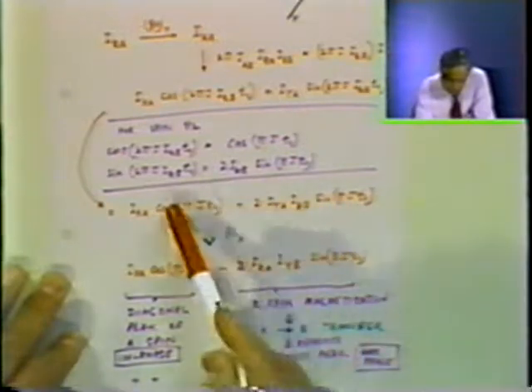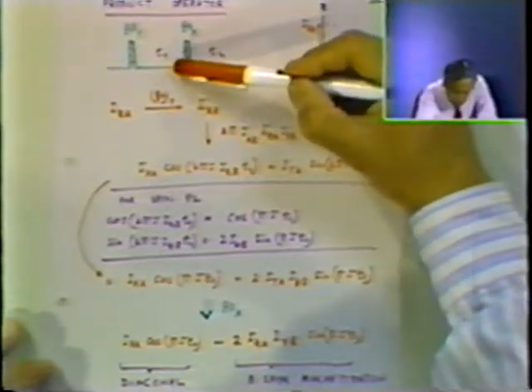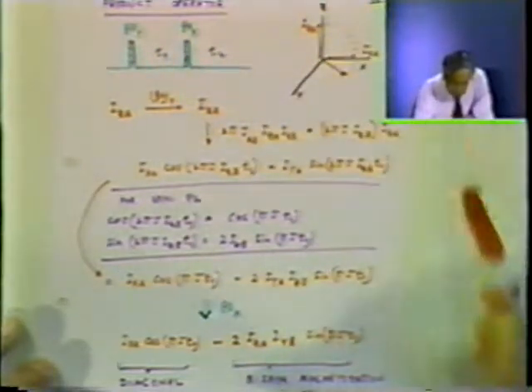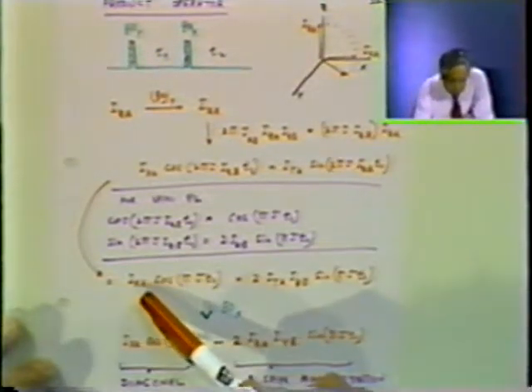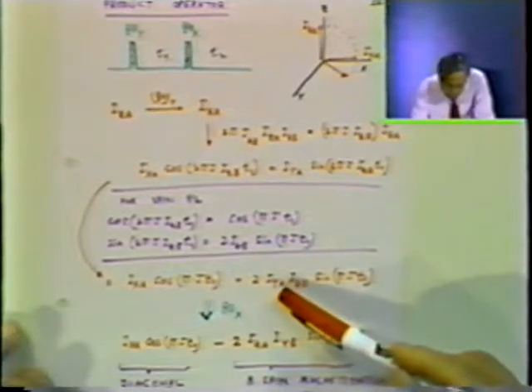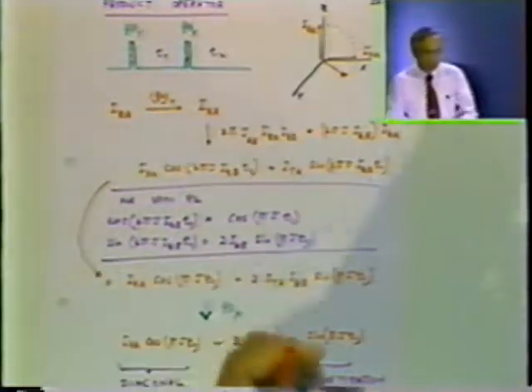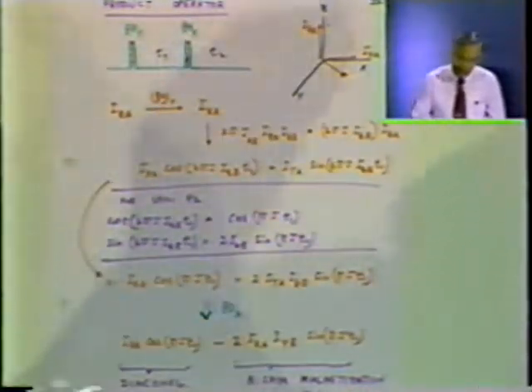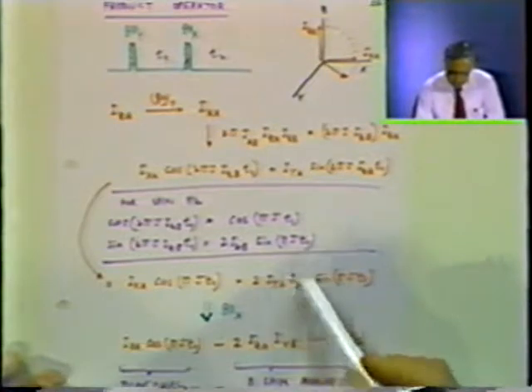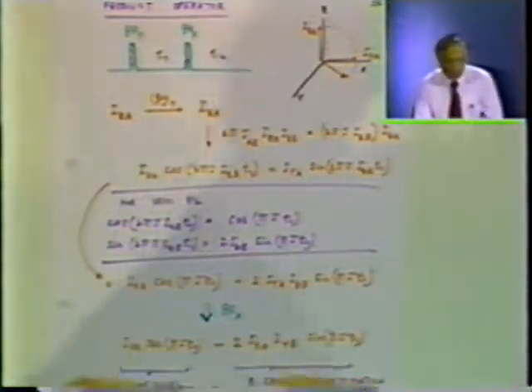This is the state of the spin at this point, before the second 90-degree pulse. What it says is that we have a magnetization along the x-axis, and we have a magnetization along the y-axis, but that magnetization has 2 components, one pointing up, one pointing down, because of this factor IZB. And this X component has both of these components pointing in the same direction.